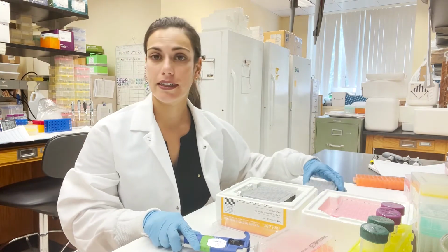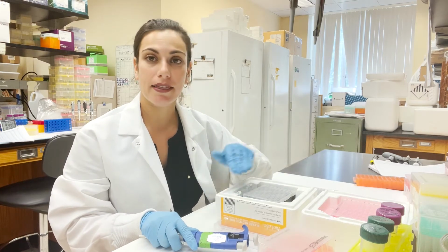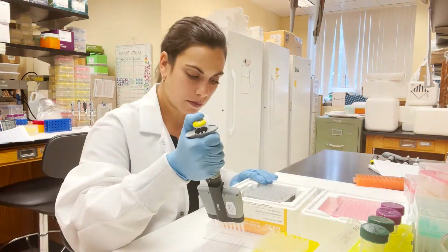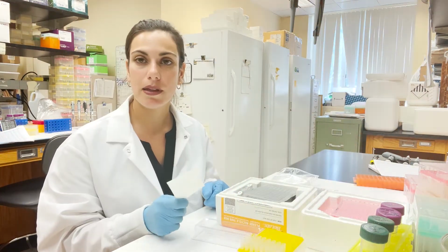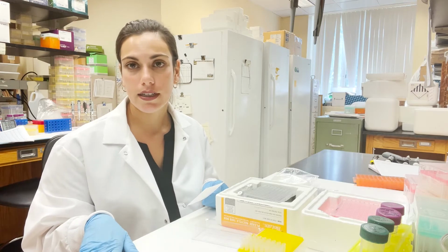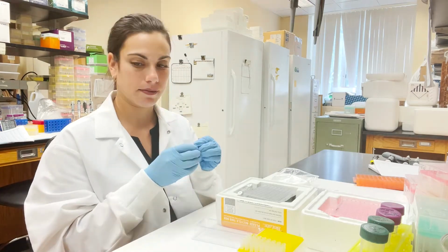Okay, now that we have our digest product and our barcodes in our plate, we can add our ligase to the master mix and pipette that into every well. So then we seal the plate with the microseal, spin it down to remove any air bubbles, and put it on the thermocycler at 22 degrees Celsius for 2 hours with a 20-minute heat stage at 65 degrees Celsius to deactivate the ligase.